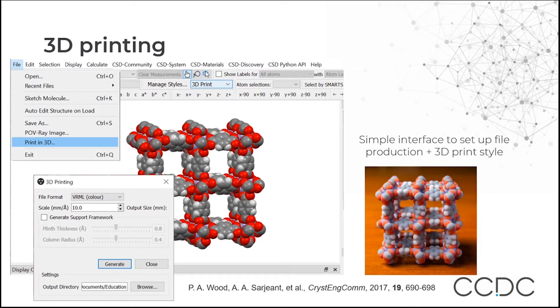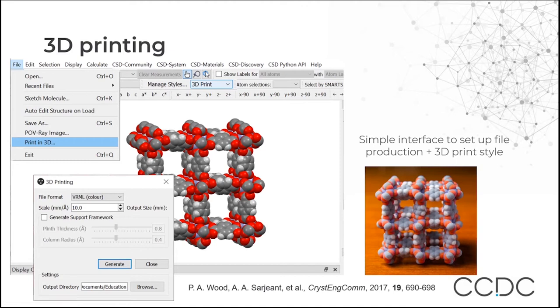If you're interested in physically touching a 3D structure and have a 3D printer at your institution or at home, you can use the 3D printing functionality in Mercury. Go to File and then Print in 3D to see the 3D printing pop-up. You can choose to print in colour or monochrome. For complicated or multi-component structures where not all components are joined, you'll want to generate a support framework too. Pressing Generate creates a 3D printing file to send to your printer. As an example, MOF-5, one of the more famous MOF structures in the CSD, is shown printed out.